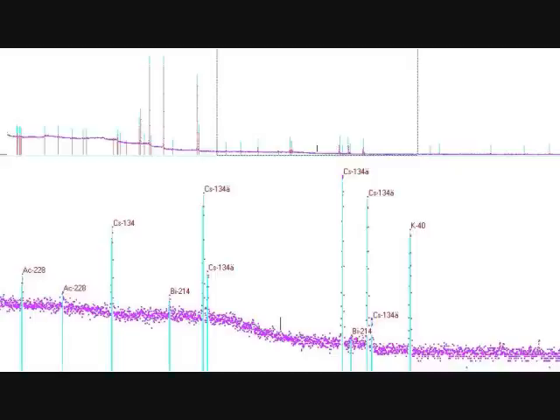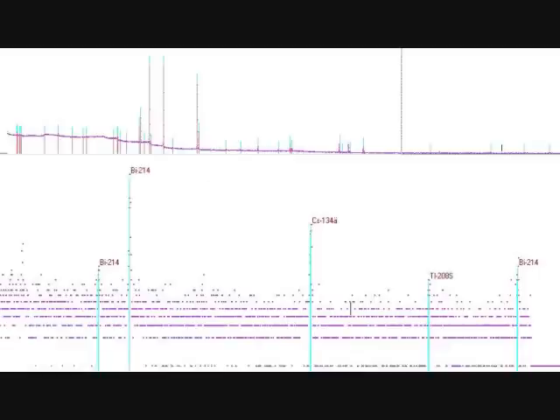Potassium is all around us and responsible for a large amount of the natural radioactivity that is within every human. Every human is radioactive with about 8000 becquerels for a standard human of 70 kilograms, out of natural radioactivity and not due to anything man-made. And in the final area of the spectrum, on the very right here, on the very high energy range, the only thing significant and of actual relevance is another cesium-134 line.